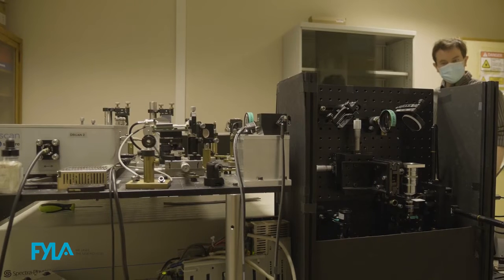My research centers on measuring ocular tissue, specifically the cornea and the sclera. And what we'd like to see is how the collagen fibers, which make up the cornea and the sclera, are interweaved and are laid out in both of these tissues.